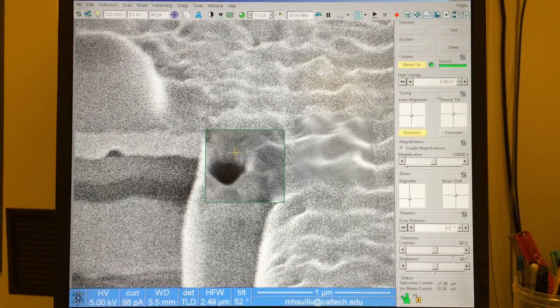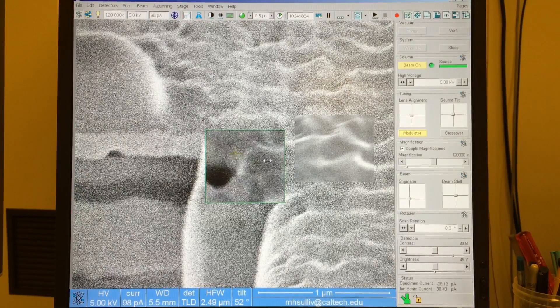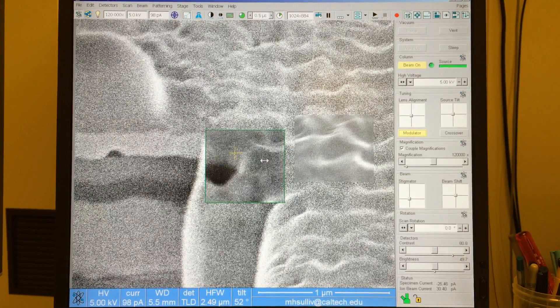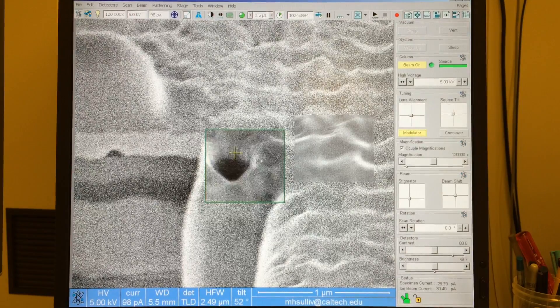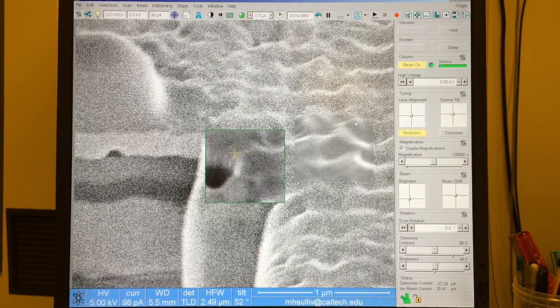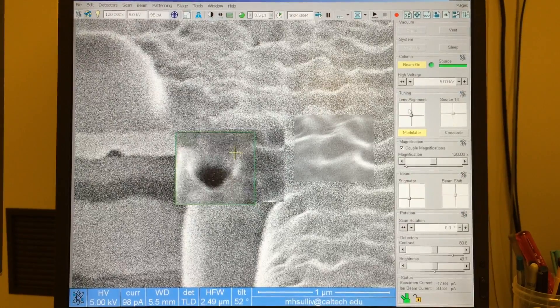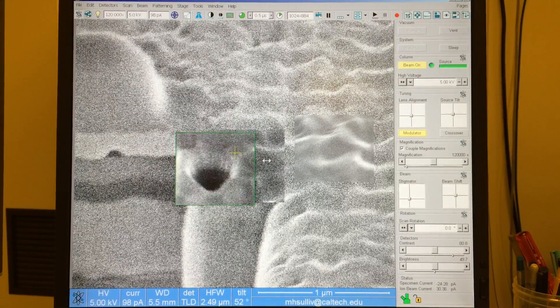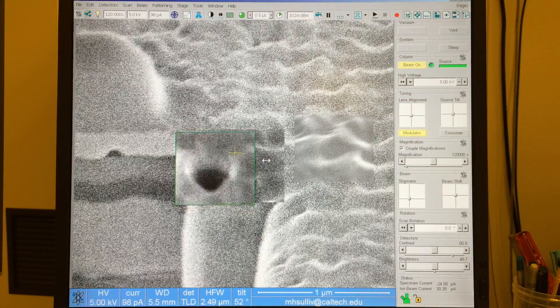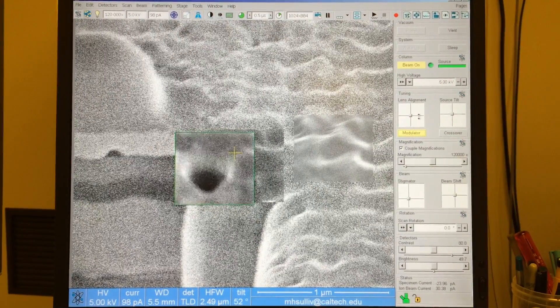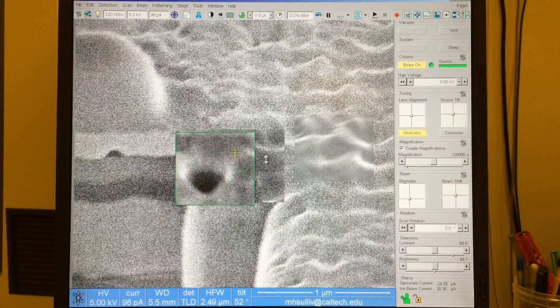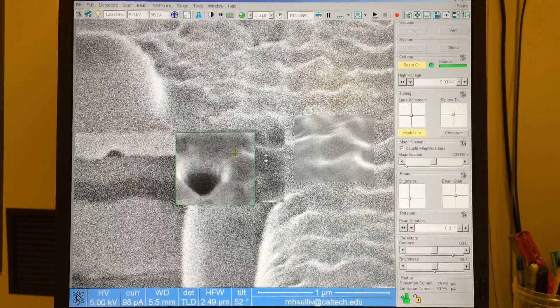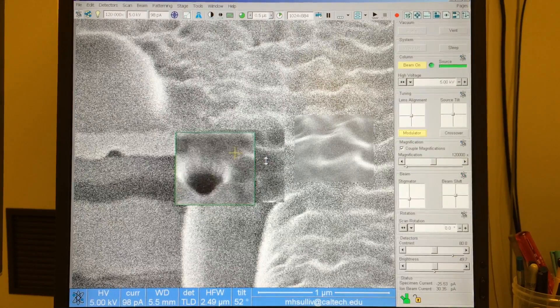And so since it's moving side to side, I'm going to grab the vertical bar and move that left or right to try to minimize the X oscillation on the screen. So something like that is good for the X. Now I don't have any Y oscillation, but if I did, I would grab the horizontal bar and move it up and down. You can see as I do that, I induce a Y oscillation. So I'll bring it back.